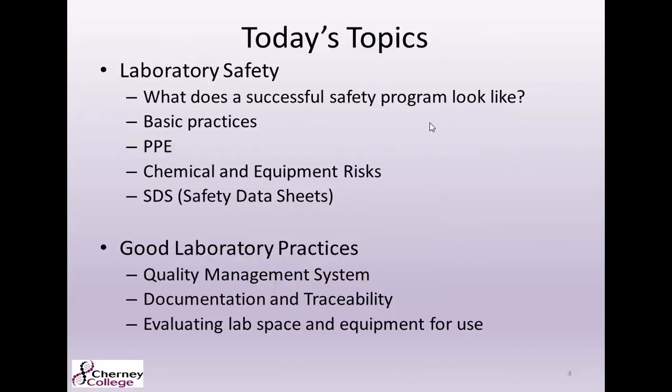All right, so today's topics. Laboratory safety: we're going to be talking about what a successful safety program looks like, basic lab safety practices, PPE, chemical and equipment risks, and SDS sheets, that's safety data sheets. We're also going to be covering good laboratory practices and going over quality management system, document and traceability, and evaluating lab space and equipment for use.